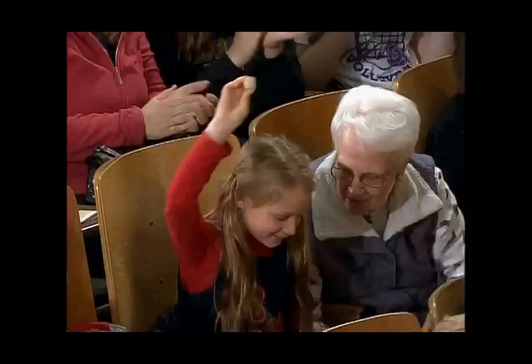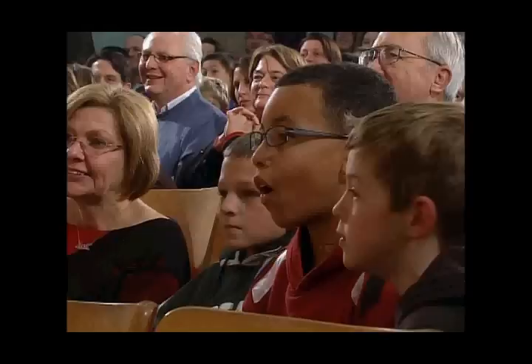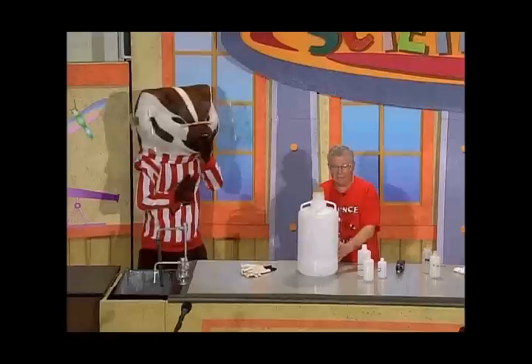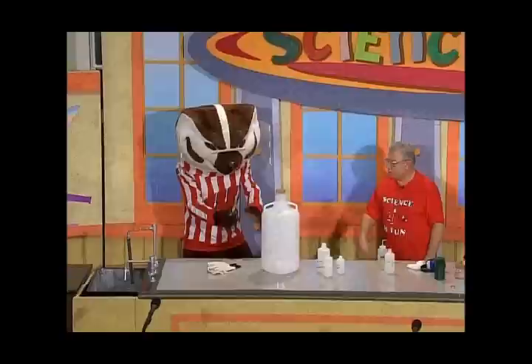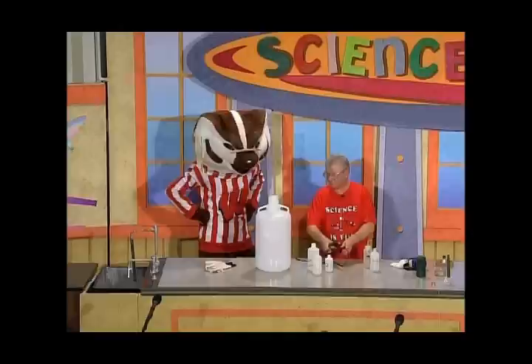I am really glad that you like this experiment because we're going to use this big bottle now. You see the two nails right here? There is the bottle, the cork on the bottle, and we have the alcohol at the bottom. We have this ready. We have the sparker, and we have Bucky Badger. So, Bucky, there you go. You do it. All right, one, two, three. Whoa. That was pretty good.